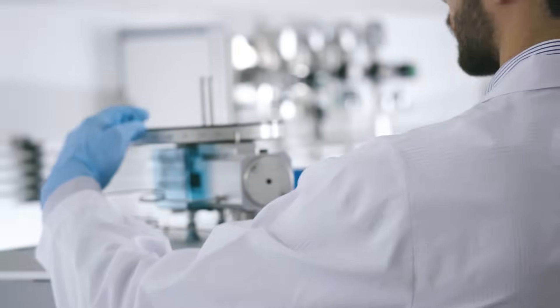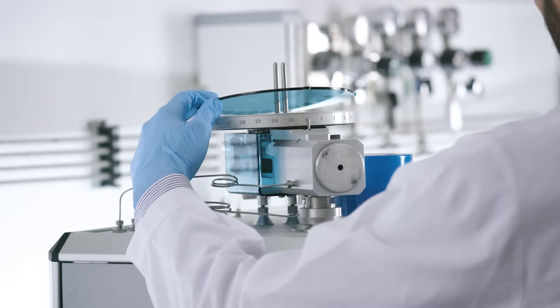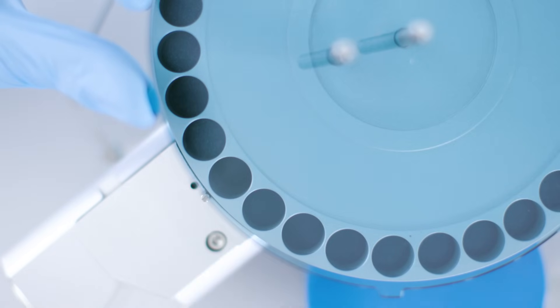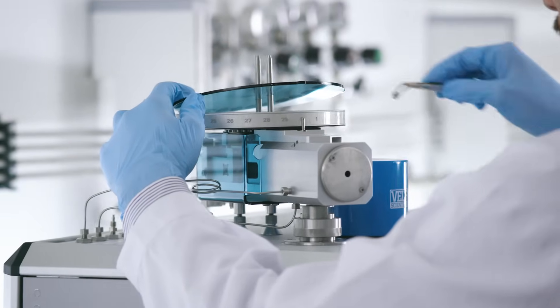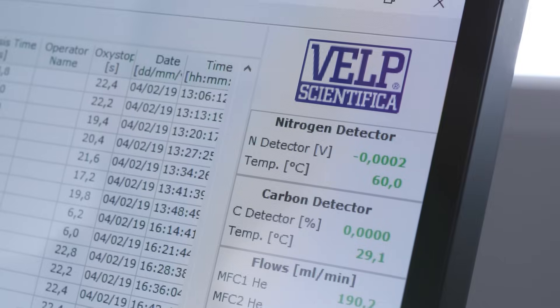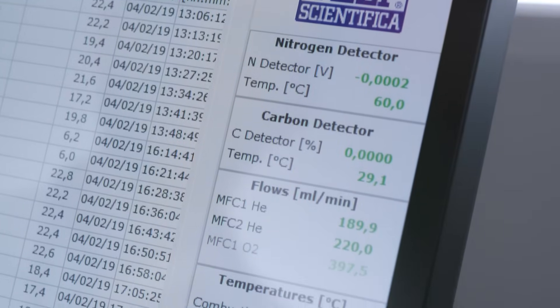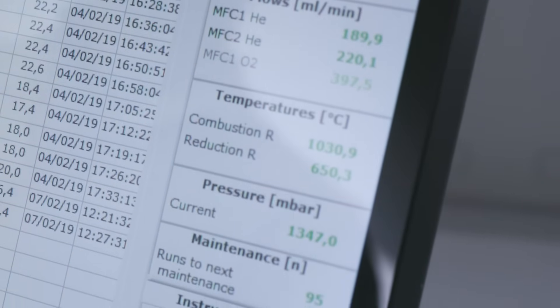The CN802 autosampler design ensures long-term reliability and can expand its capacity with up to 4 disks of 30 positions each to maximize lab productivity with excellent uptime. The CNSoft software shows all the critical information at a glance.